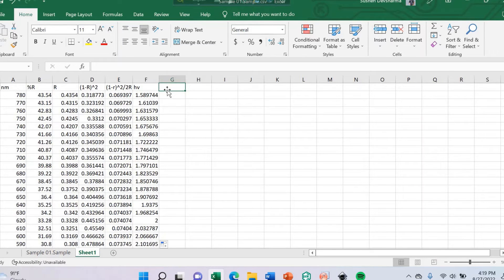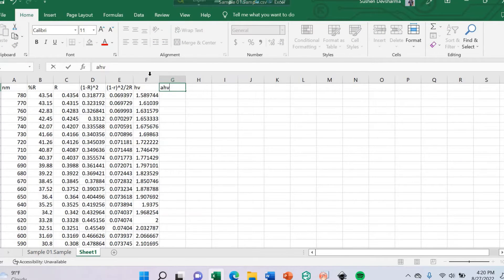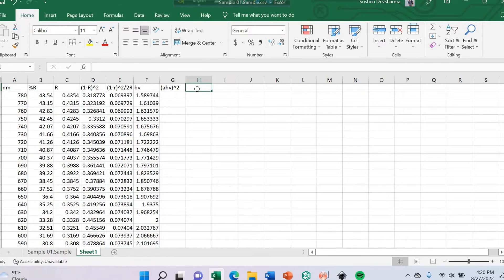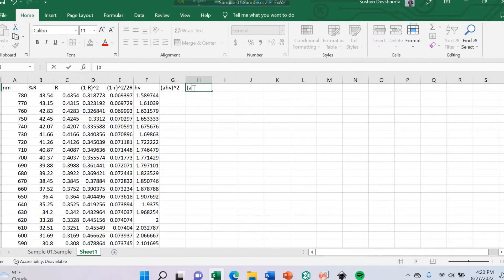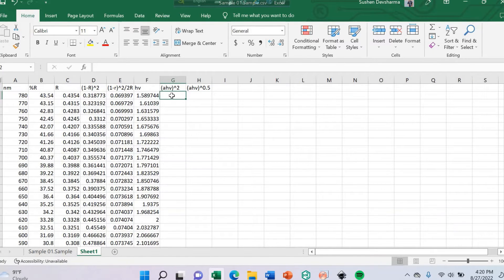Now we can determine the band gap. There are two types of formula. One uses absorption coefficient alpha times hν to the power of 2 — this is the direct band gap. The other formula uses alpha times hν to the power of 0.5, which gives the indirect band gap. Let's calculate the indirect band gap in this UV-Vis spectra.